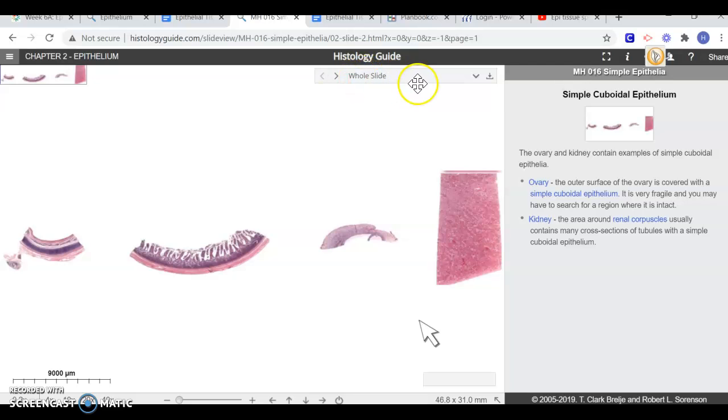If you look at this little toolbar, it lets you pick specific things that you want to see. It's really awesome because it takes a lot of the guesswork out of it. And along the bottom, a lot of times you can pick the magnification. Like I said, mostly we want to go with 400x, which is the 40x that's shown here. So we want to zoom in on the kidney, and I'm just going to click on kidney to show you how this works.